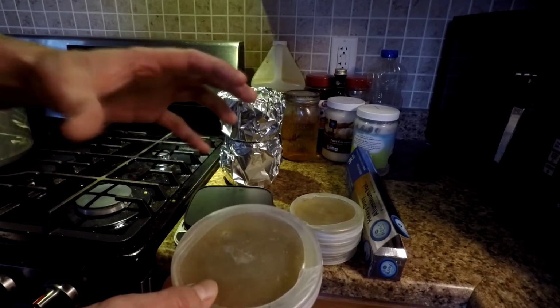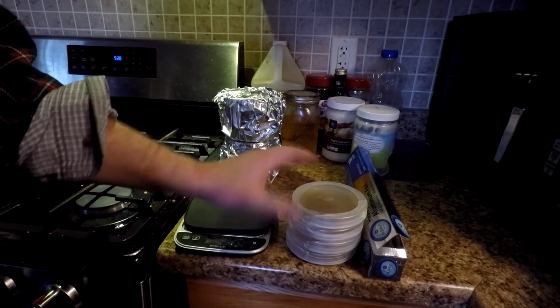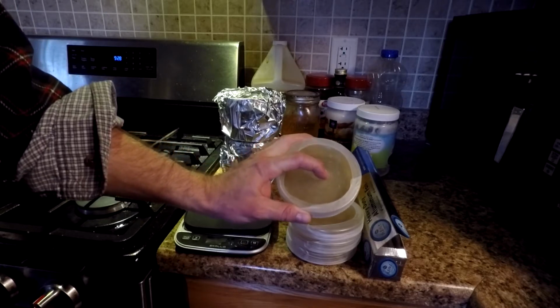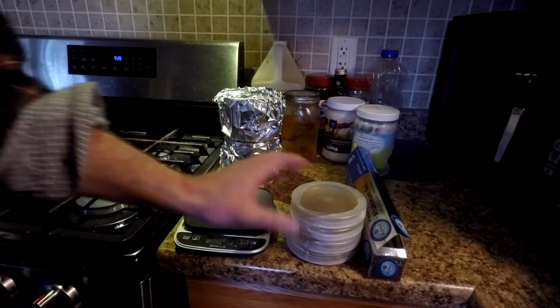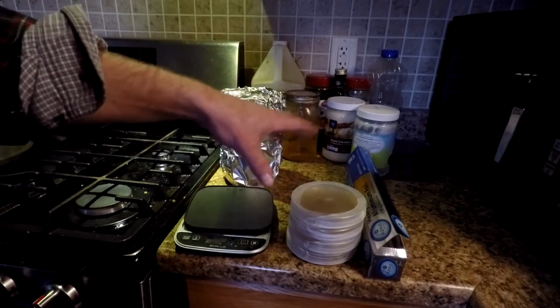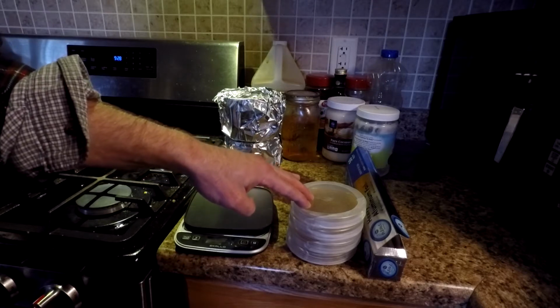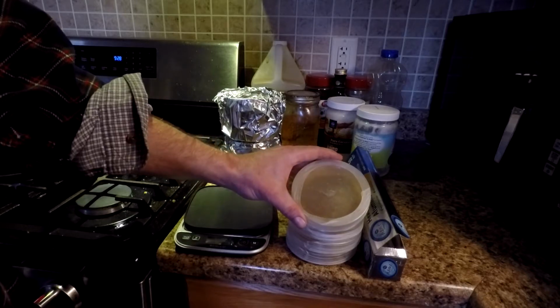Giving a little bit extra time for the agar to cool will make it not so steamy when I put it into the dish, because it's the steam that gives rise to the condensation on the agar itself and around the dish. So get the agar in there at the right temperature, where it's gelled up but not so fully gelled that I can't pour it, so you have to monitor it a little bit better, and that will give a much better grow environment for our spores to hatch.